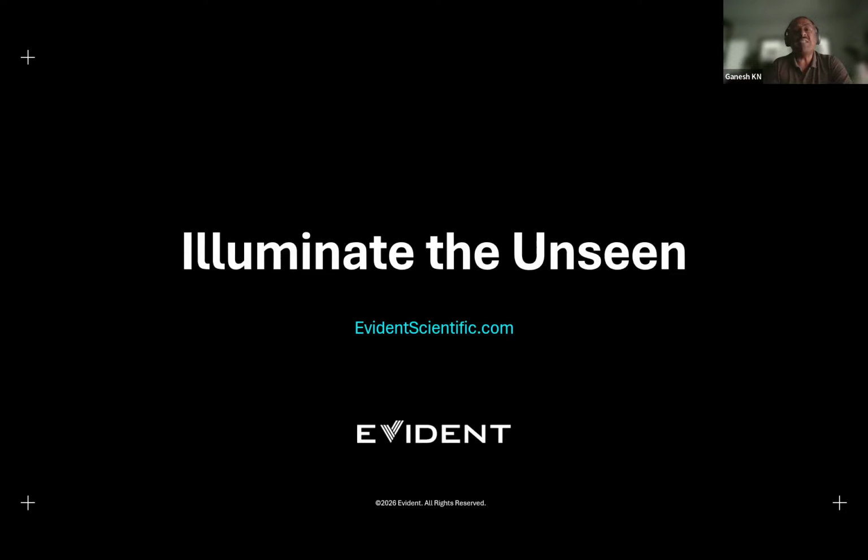But Nipkow was not efficient enough in utilizing the laser because 70% of the light was being blocked by the inter pinhole regions. So in order to enhance the excitation efficiency, Yokogawa came out with a module called micro lens on the excitation side. Dual disk technology with a micro lens has helped us to greatly enhance the excitation efficiency. It has become a gold standard, but it was not addressing the requirement of a super resolution.